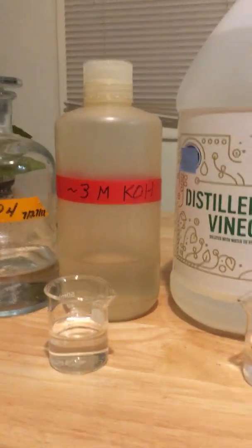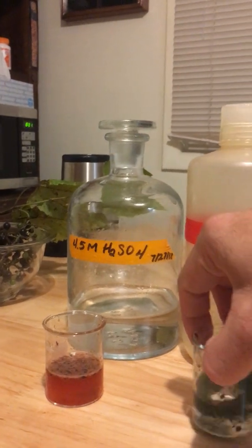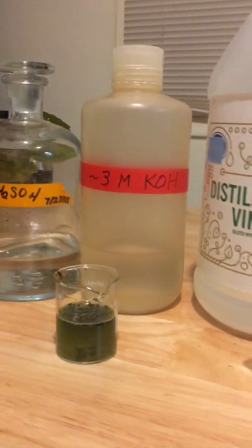Now we're going to pour some into a base — potassium hydroxide. We're going to swirl that in, and you can see that it's turned sort of a blue-green color. And that's what it does in a base.